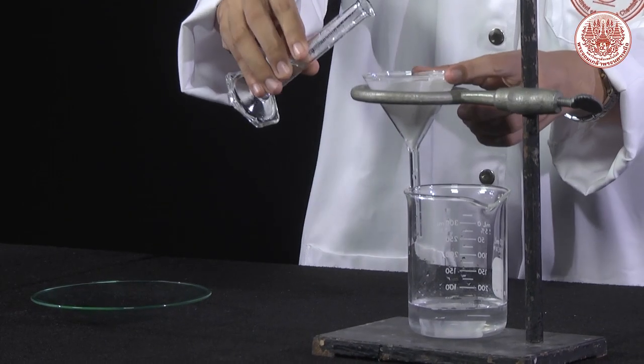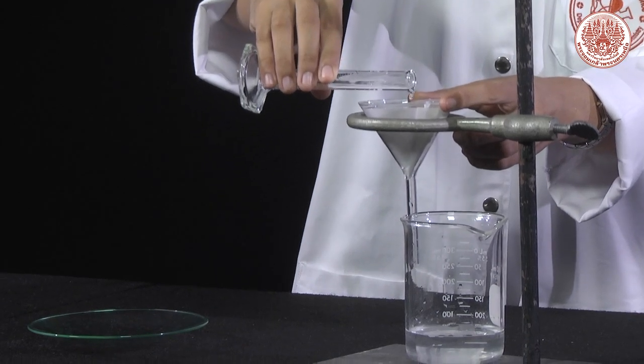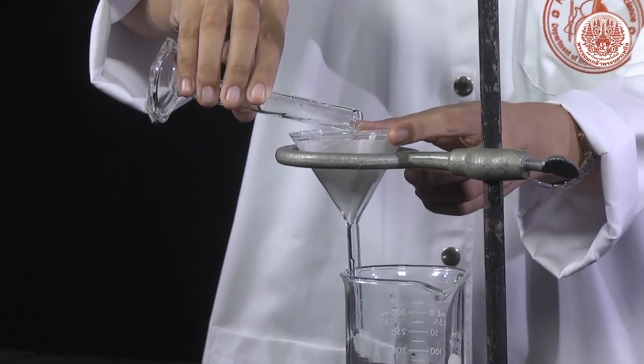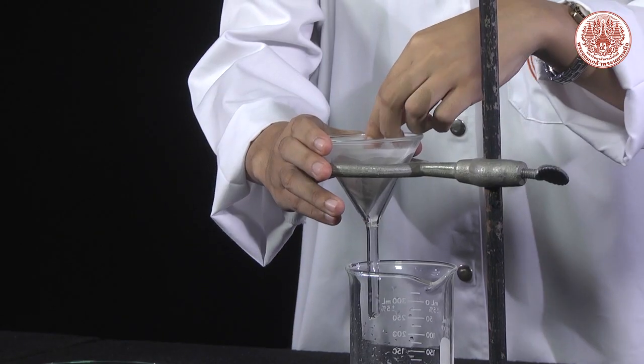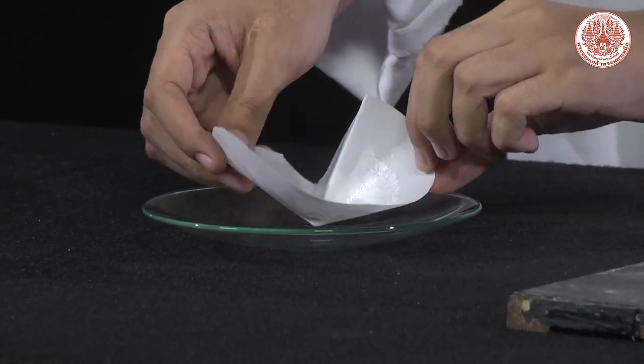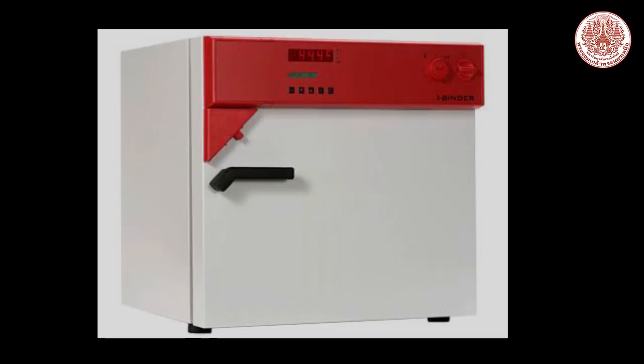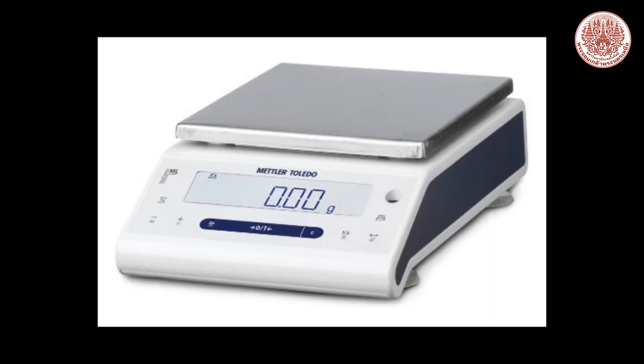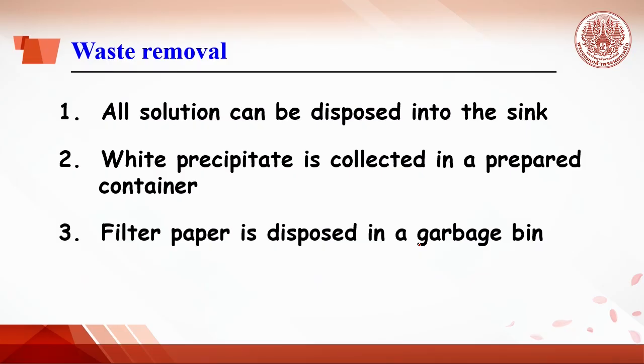When the liquid in the filter paper is dry, pour over white precipitate on the filter paper with 5 mL of acetone. After acetone is dry, move the filter paper with precipitate and place on the watch glass. Then put into the oven at 80 Celsius for 20 minutes. Let the precipitate cool down and weigh the precipitate with filter paper and watch glass. All the solution can be disposed into the sink, while precipitate is collected in a prepared container and filter paper disposed in the garbage bin.